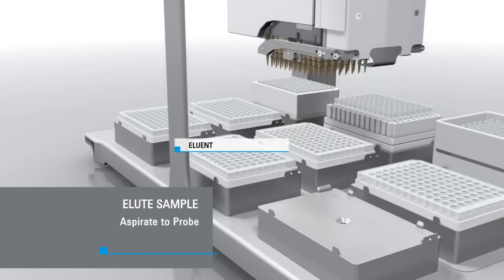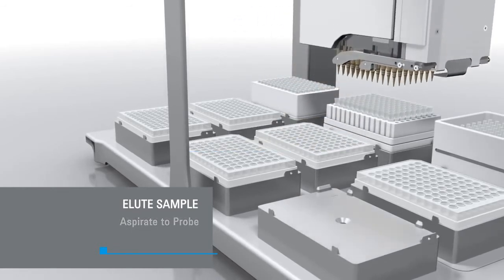Next, the purified antibody is eluted from the cartridge into the eluent collection plate.